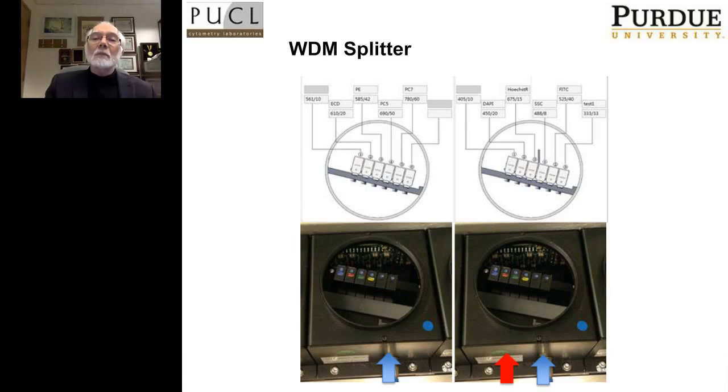But in this, on the right-hand block, you'll see at the bottom, there are 2 arrows, and that is representing 2 fiber optics that are coming into this block. Now, on this particular one, there's actually only 1, but I'm diagrammatically showing you that 2 could come into this. But above, you'll see that there's a small bar in the center of the circle. I don't know whether you can see my mouse, but I'm actually pointing to the middle of the right-hand circle. There's a little bar there. What's actually happening here is that that mirror is split into 2.